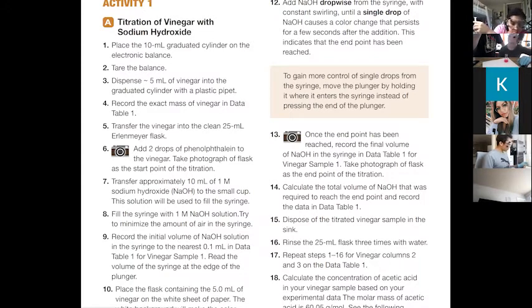So what do we have? 5.8. Okay. So 4.2. You want to do one more? Sure. Might as well, since 2 of them went over. And the third one, one of them is really good. Basically, we're not using materials made for this. We shouldn't be using a syringe. We should be using a burette. But we don't have a burette. So we're making do. Exactly. All right, so this will be our last one.